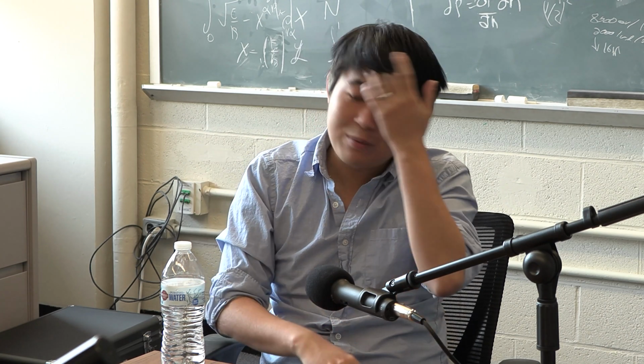Yeah, it was very exciting. I remember I worked on this with another graduate student, Paul Tilburg. And we didn't really know if it would work. It seemed kind of out there. But we did this first experiment, and we were imaging it at like 3 a.m. We were imaging it as it progressively got bigger, and we were like, oh wow, this cell is getting a lot bigger, right? This thing might work.